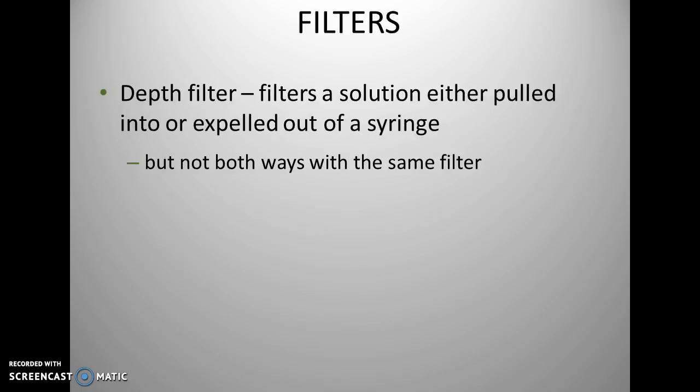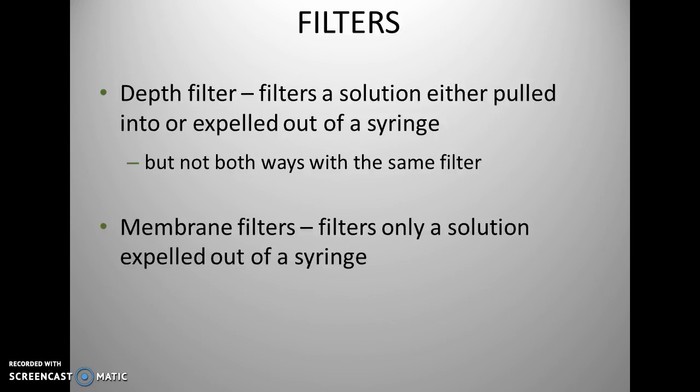Okay, and the purpose of that is to ensure that particulate materials do not get into the solution. So again, a depth filter filters a solution either pulled into or expelled out of the syringe, but not both ways of the same filter. Then membrane filters filter only a solution expelled out of a syringe.